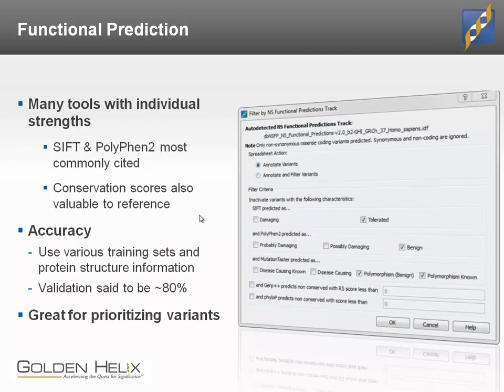You might have a very large protein, maybe it's got some subdomains that can tolerate a little bit of mutation, and so you can actually look at things like conservation scores and other types of clinical information and build giant predictive models that essentially predict whether a non-synonymous variant will degrade the function of a protein. So the common ones here are SIFT and PolyPhen-2. And there's this great catalog that's been published called the Database of Non-Synonymous Functional Prediction that we're going to use that actually pulls a lot of these things together in one great place.